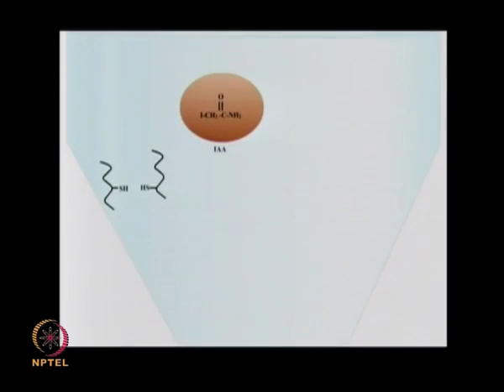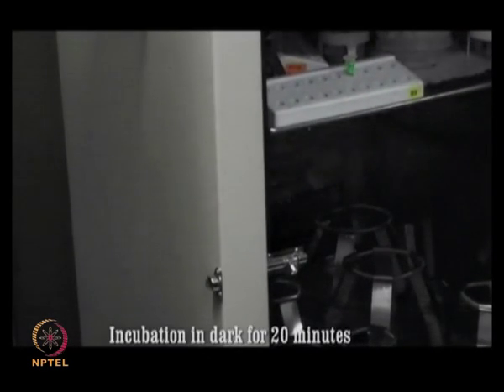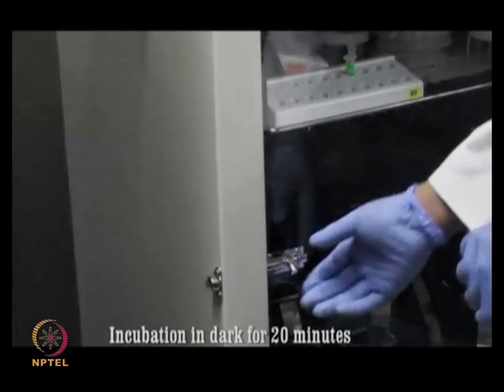The iodoacetamide prevents the reformation of disulfide bonds. It is an alkylating agent. It adds an iodoacetamide group to the sulfhydryl group and prevents disulfide bond formation.